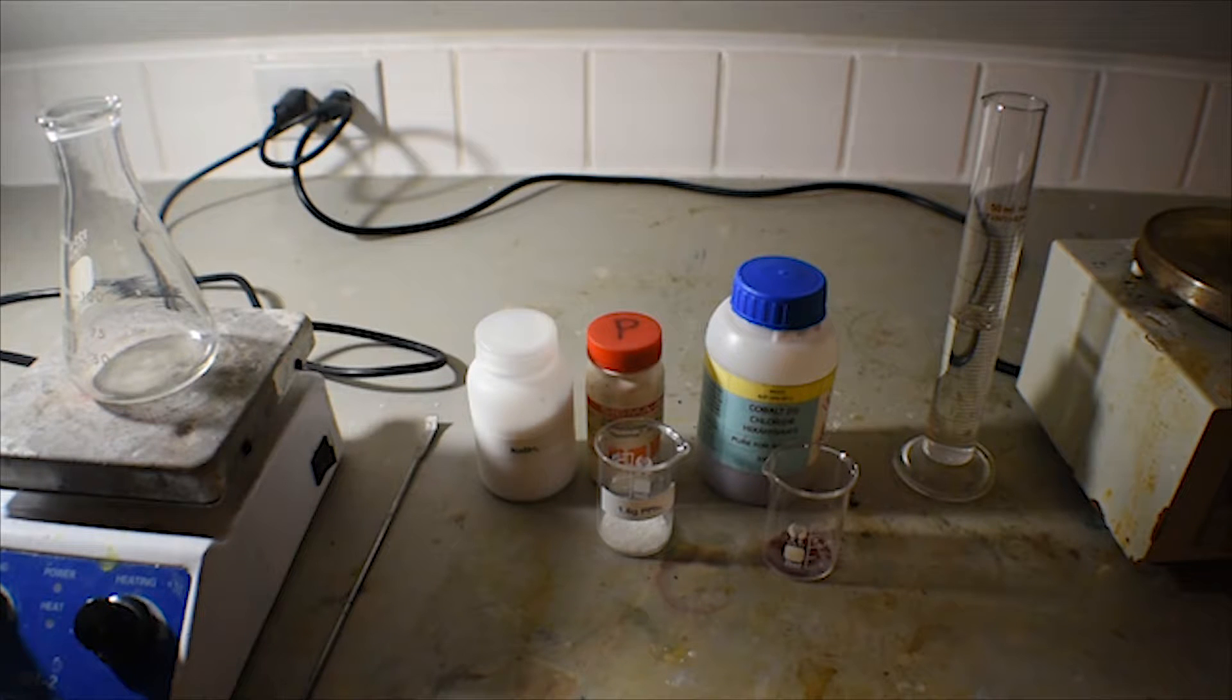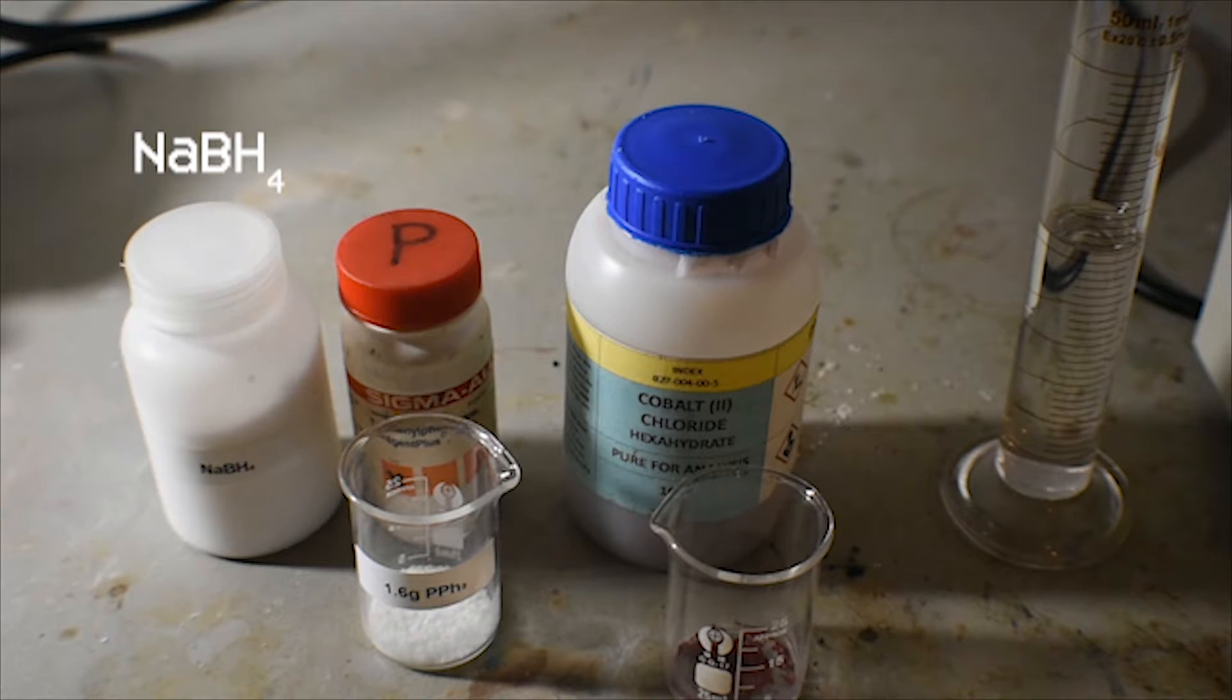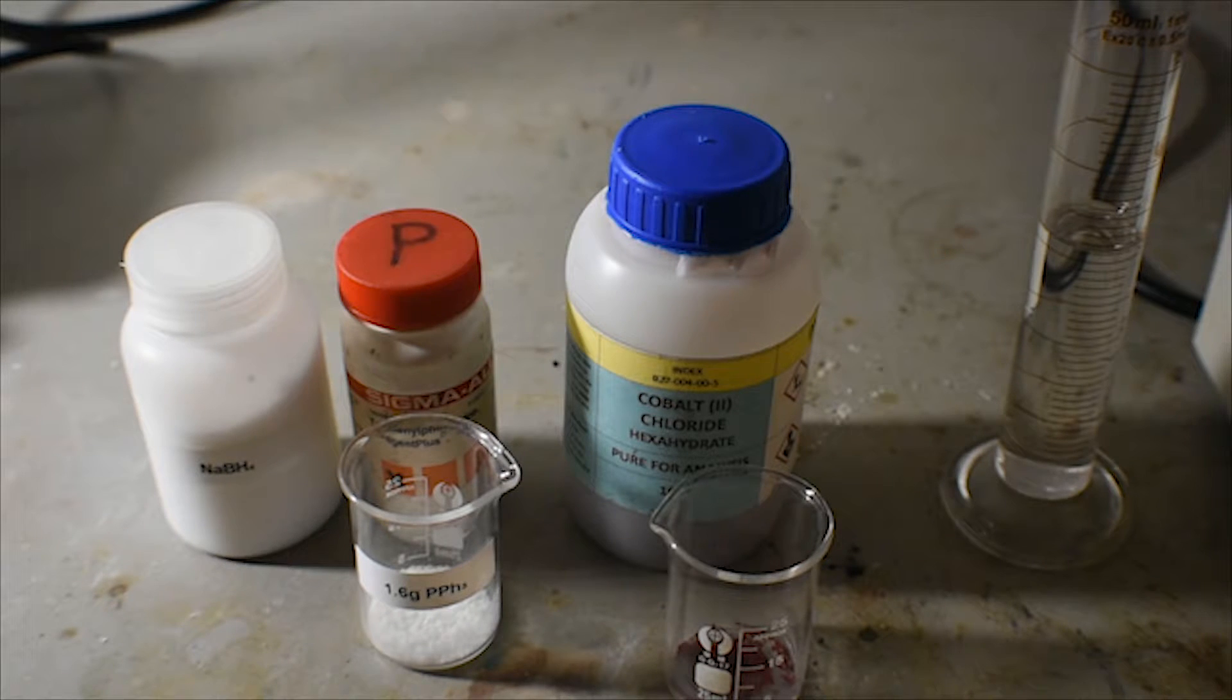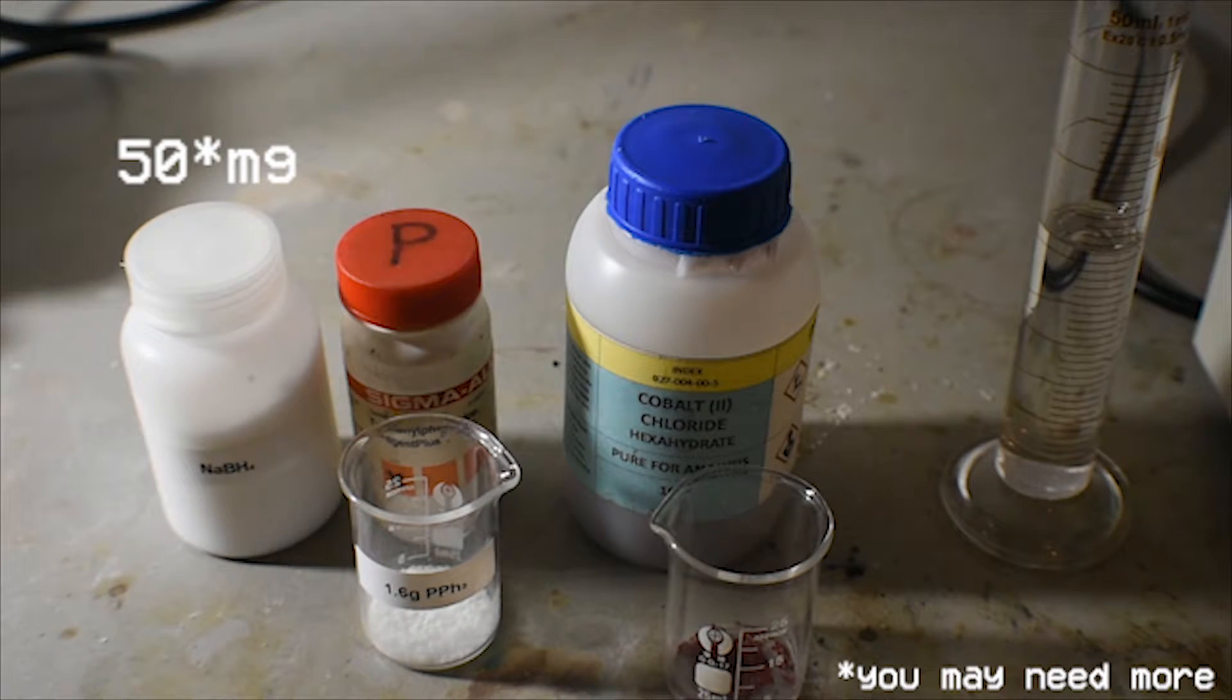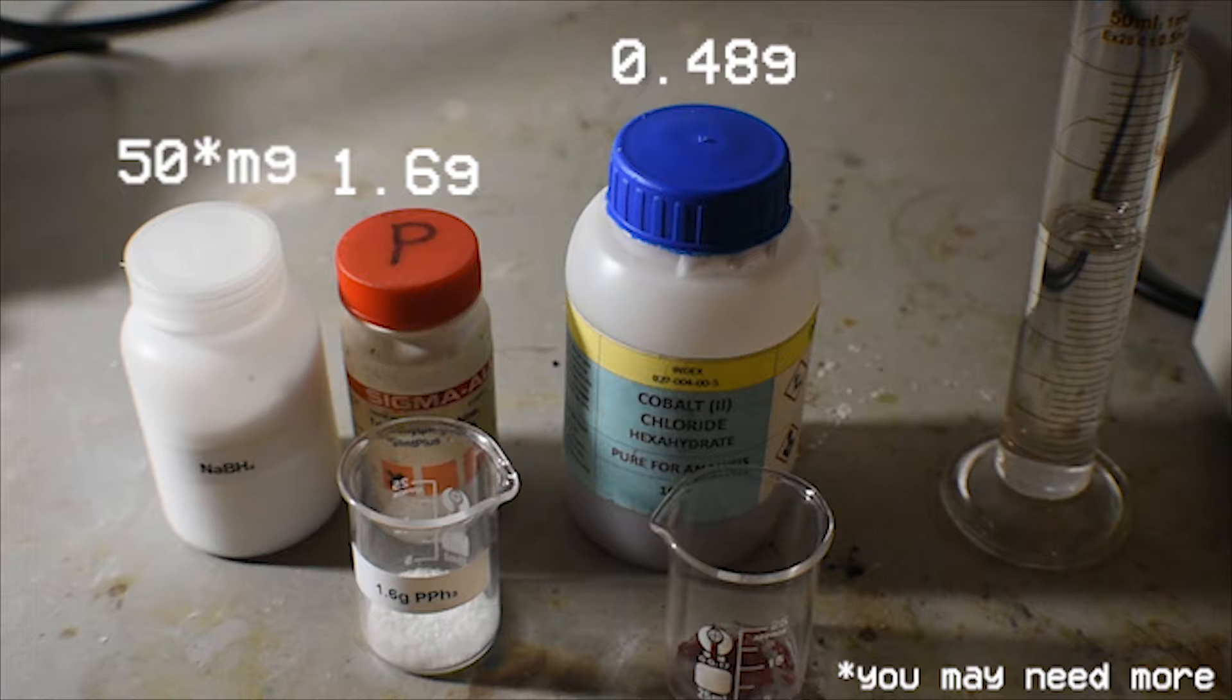This synthesis is fairly simple, and only requires a few ingredients. The main reactants are sodium borohydride on the left, triphenylphosphine, and cobalt-2 chloride hexahydrate. The amounts that we will need for this are 50 milligrams of sodium borohydride. However, if you need to use more, that won't affect the reaction in any negative way. For triphenylphosphine, we will need 1.6 grams. And finally, for the cobalt-2 chloride hexahydrate, 0.48 grams of the solid will be needed.